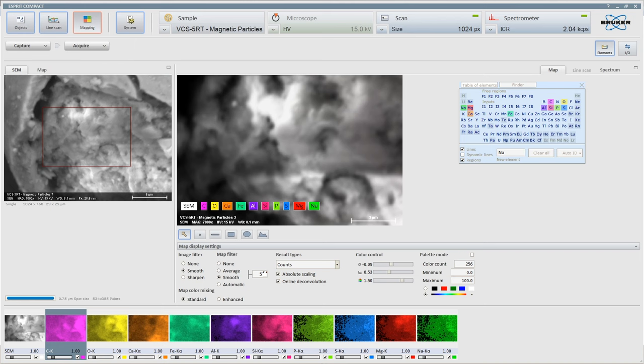And how big is that one, the broken one? That one's 50 and a bit microns across. It's in the sort of scale of the ones that you were finding. So visible to the human eye, barely. But yeah, you can see it as a circle. So then there's this agglomeration, and I'm wondering if these agglomerations are a lot of stuff that's come out of a broken one, like this stuff. This stuff has come out, and it's in here, but it's got mixed iron in there, so it is magnetic. I think when I look at these, I'm going to see that same kind of pattern that you saw with these toroidal clusters, and it's just a whole agglomeration of it.